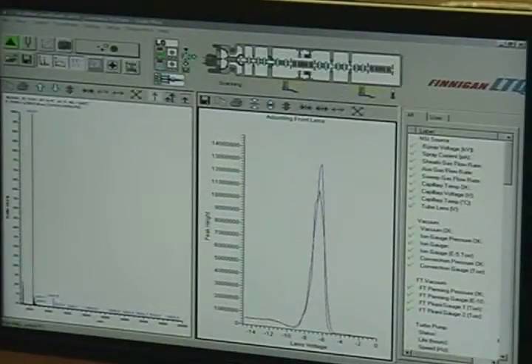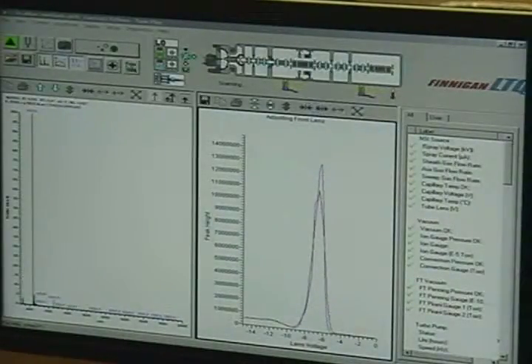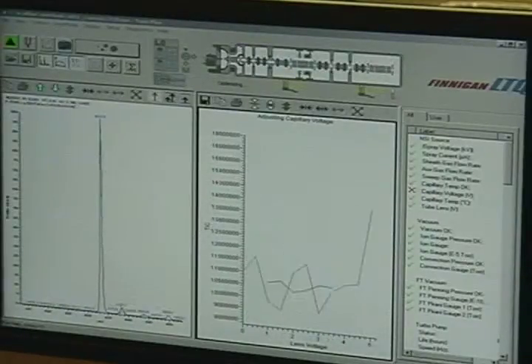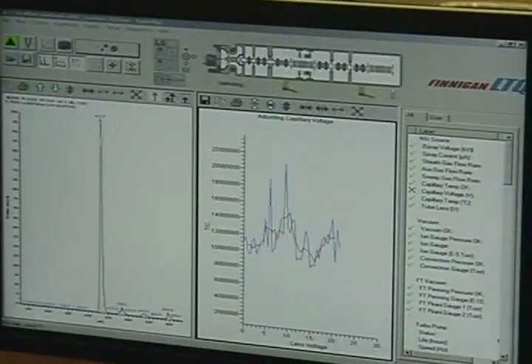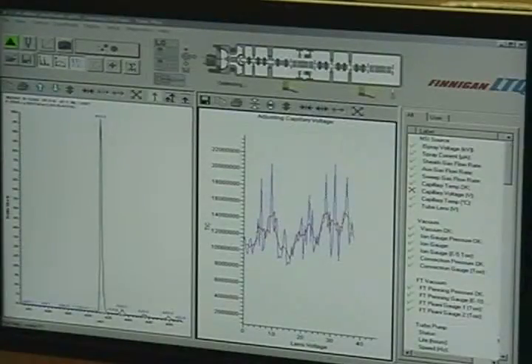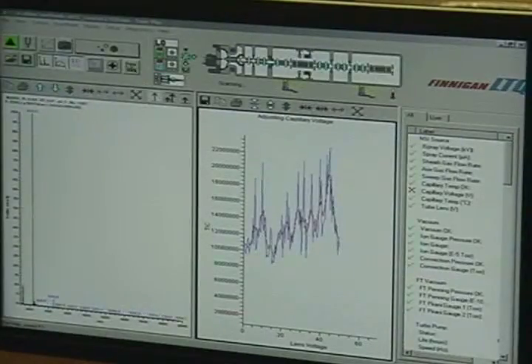So we go to semi-automatic. Okay, make sure your mass says 433. Okay, yep, right there, cool. He picks his capillary voltage and he hits start. Okay, hit OK. And we see if there's a maximum or not. You just want to expand the range, is that the idea? Yeah, we got to expand to see a max. This one you typically need to expand beyond where the semi-automatic is. Yep, hit accept. So he's going to take his start lower and his end higher.